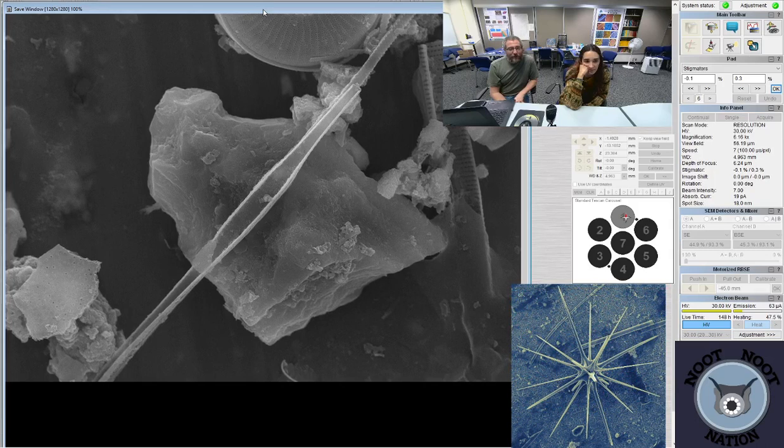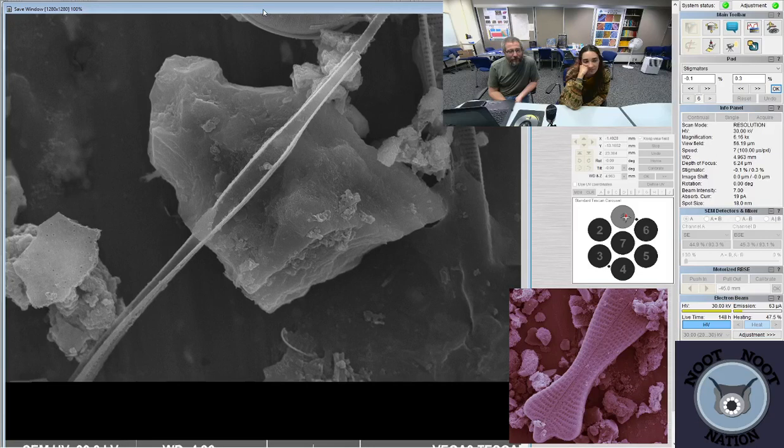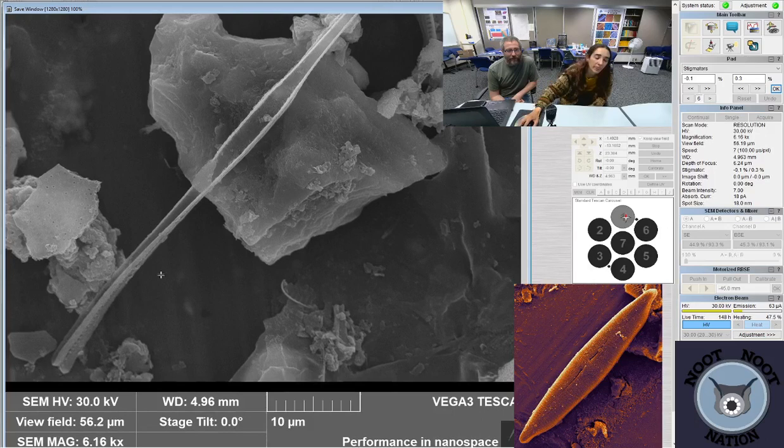So in order to avoid that, we use nitrogen gas, which is basically an inert gas, but it's effectively air. It's like an air tank. And we use nitrogen because it's most of the composition of our atmosphere anyways, and it quickly dissipates when I pump it into the chamber and then open the chamber. So it's not a big deal. It's basically a way for us to have pure air pumped into the chamber in a relatively cheap way.